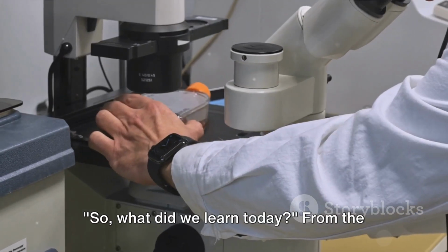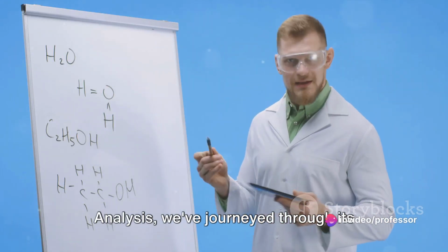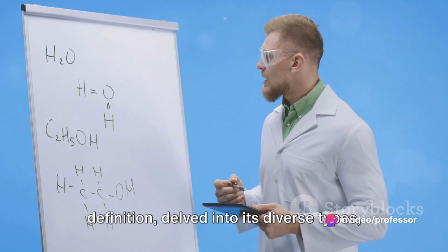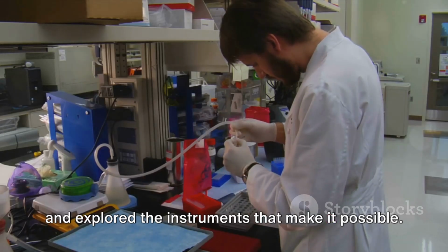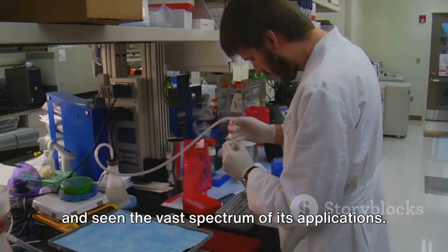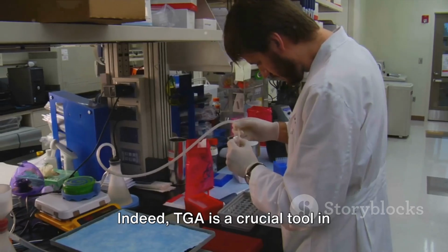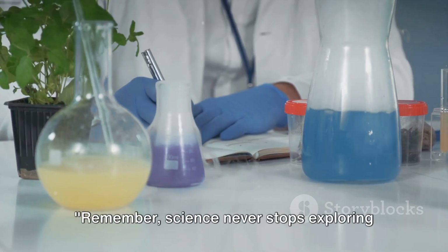So, what did we learn today? From the intriguing world of thermogravimetric analysis, we've journeyed through its definition, delved into its diverse types, and explored the instruments that make it possible. We've understood its guiding principle, and seen the vast spectrum of its applications. Indeed, TGA is a crucial tool in scientific research.